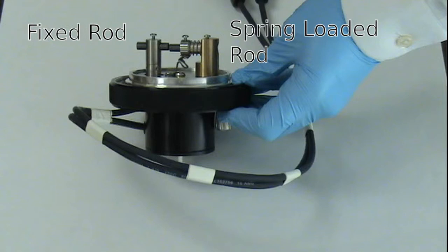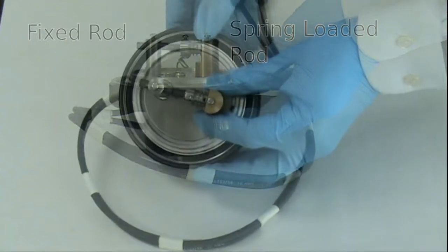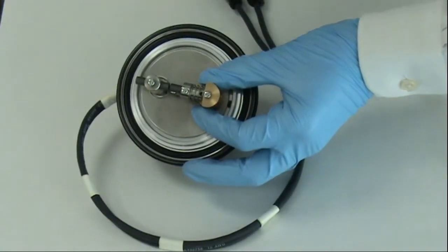The spring-loaded rod needs to be replaced after every use. After cooling, loosen the standard screw on the spring-loaded post and remove the used rod.